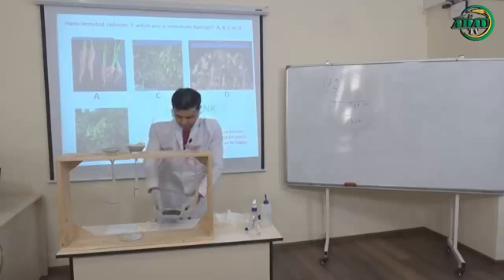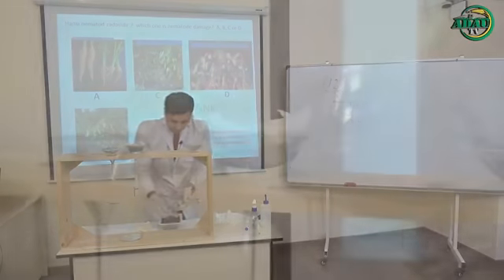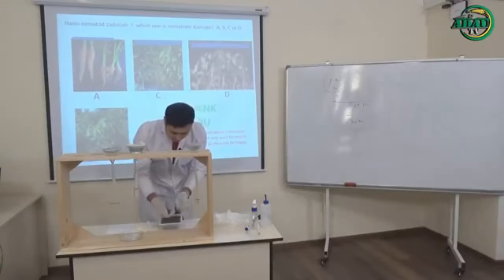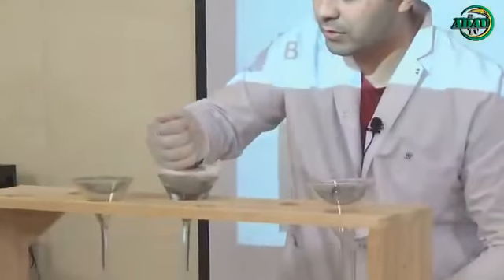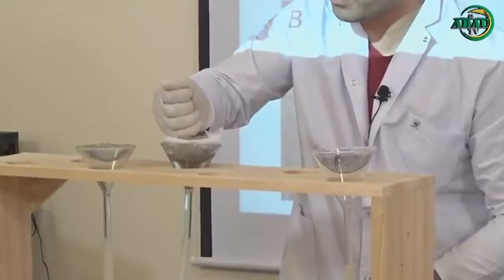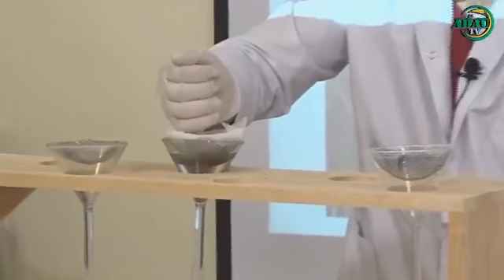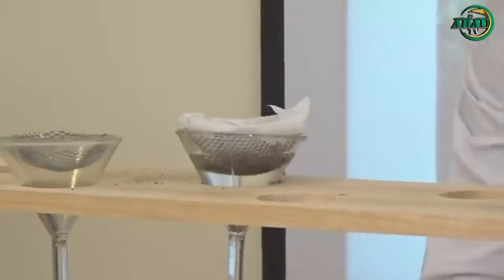take soil, and try to make it into smaller parts. Try to push them and make smaller parts. Like that. After that, it is so easy.